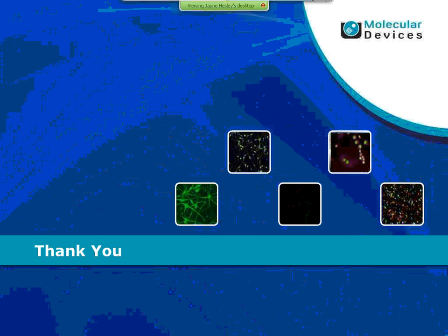Glass bottom allows you to use higher quality, higher numerical aperture objectives, and that's useful for sensitivity and resolution, especially at higher magnification. At lower mags, there might not be as much advantage. The caveat is that you'll need to do some development with your cells, because many cells do not attach and grow as well in the glass bottom plate.